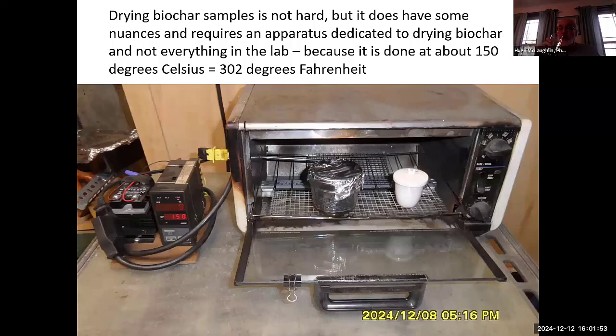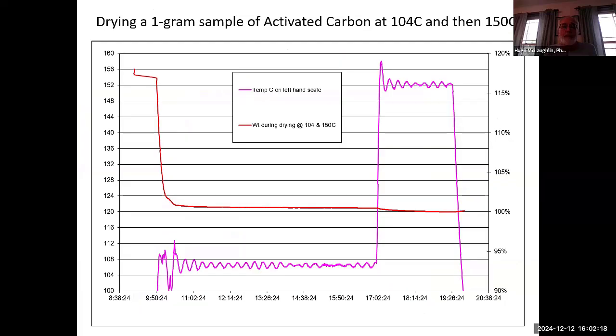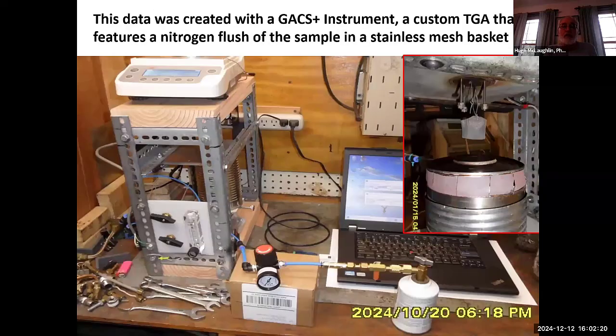On the left is a slightly better thermal control device, but to be honest, the toaster oven is close enough. We're trying to dry it between 140 and less than 200 degrees, and we're trying not to strip the volatiles off, which is the reason we have foil over the top of the jar or a lid on the crucible. And we can do drying in this thing, as we'll see.